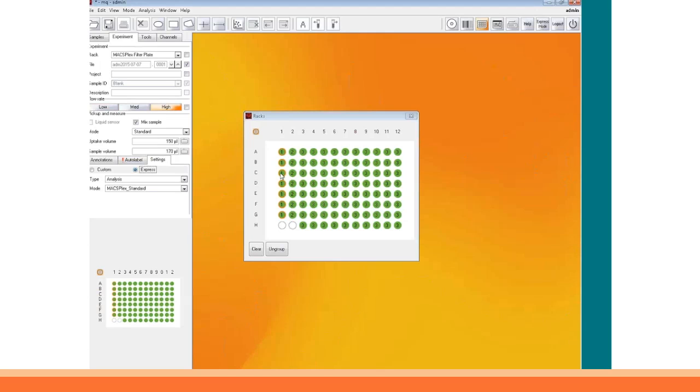You see that a 1 is displayed in all the positions. That means we have a group position. So all those 7 standard positions are finally saved within one data file afterwards, and also over here for the second column of the MACSPlex standard. And over here we have the positions for the MACSPlex sample. So there you detect your unknown sample positions.